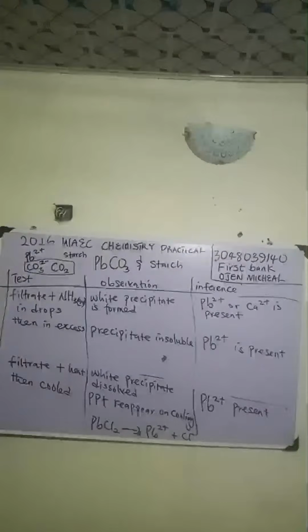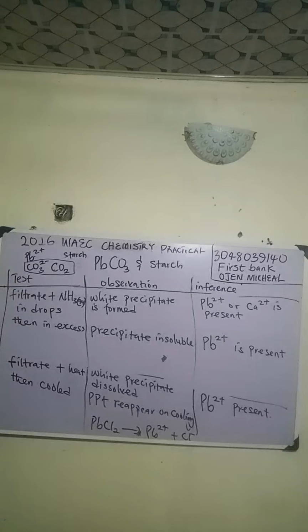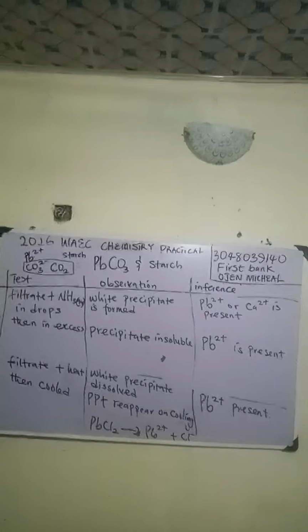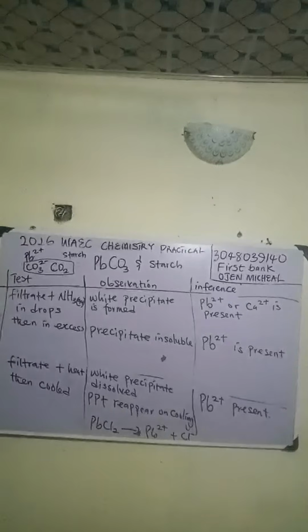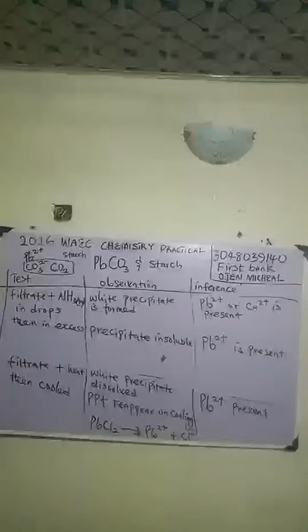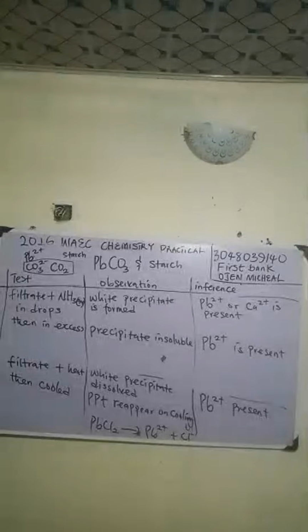So do the HNO3 on a board. I'll just explain you. I hope you are following. Are you following? Are you following? It's starch granule. Yes, starch granule.